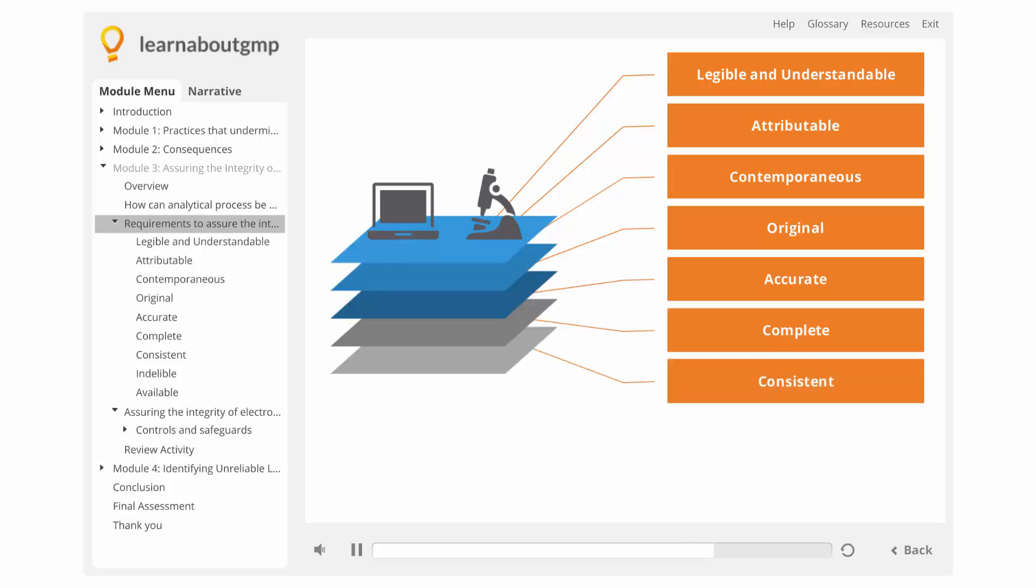Consistent. All elements in the sequence of analysis must be date and time stamped and must be in the expected order. Indelible. Records are made onto controlled documents, such as laboratory notebooks or controlled worksheets, or saved to electronic media.